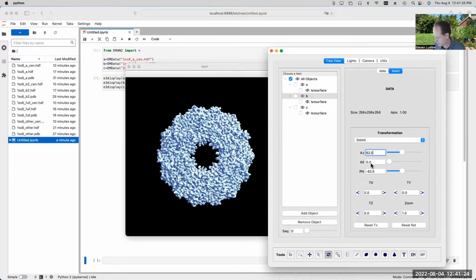Okay, so why is that? Because this is a ZXZ rotation. So we rotate around the Z-axis, then we rotate around the x-axis, then we rotate around the z-axis again. So these are basically just counteracting each other. But if I do an altitude rotation now, it's going to be rotating around the rotated coordinate system, right? So it does the 62.5, then I rotate the altitude, and then it does the opposite z rotation. So that should, well, kind of right.